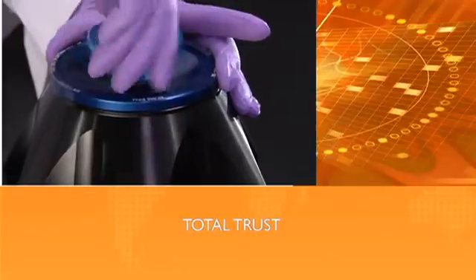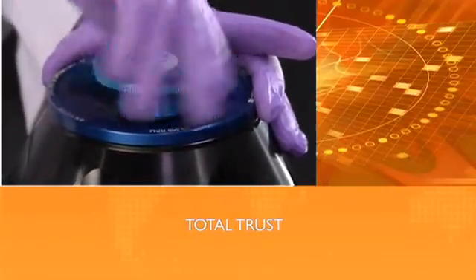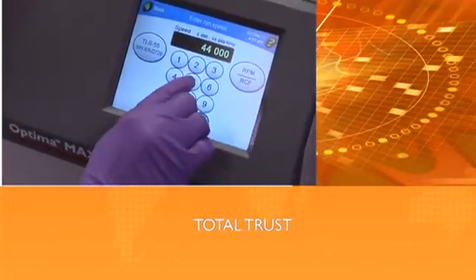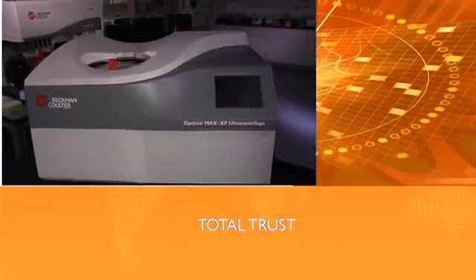In fact, 95% of the published protocols citing tabletop or micro ultracentrifuges reference a Beckman Coulter instrument or rotor, making Beckman Coulter the most trusted name in tabletop ultracentrifugation.